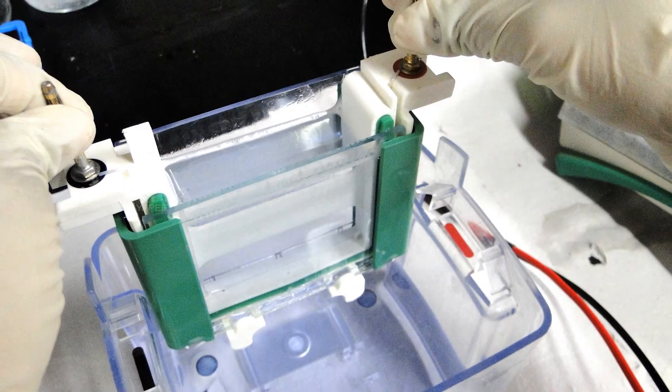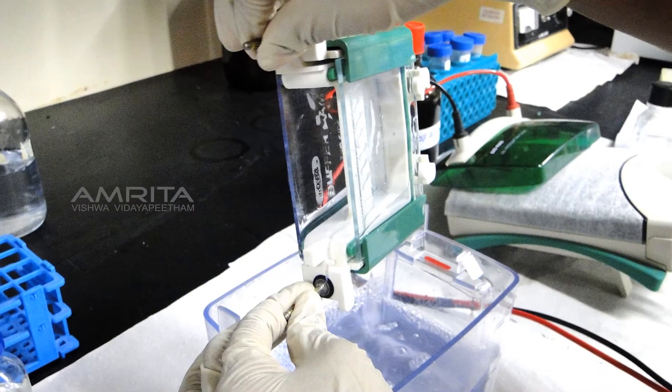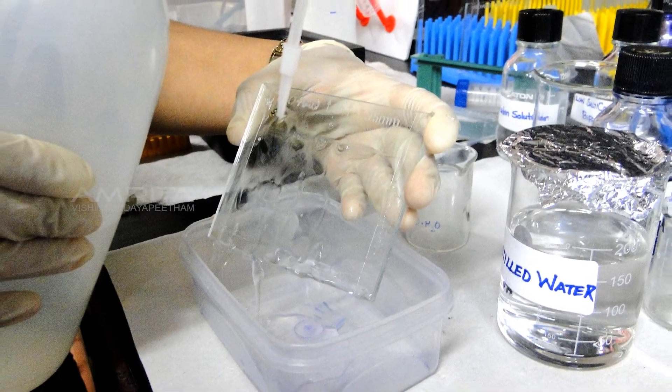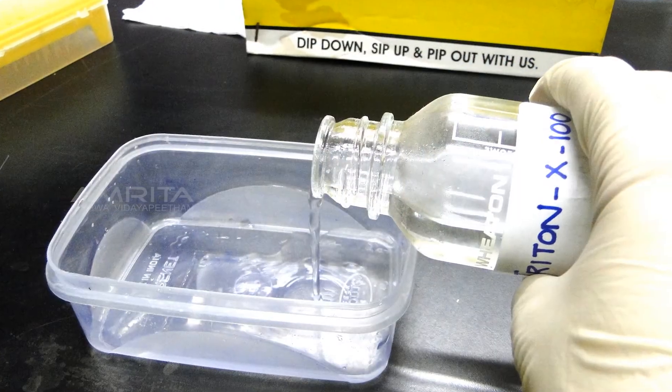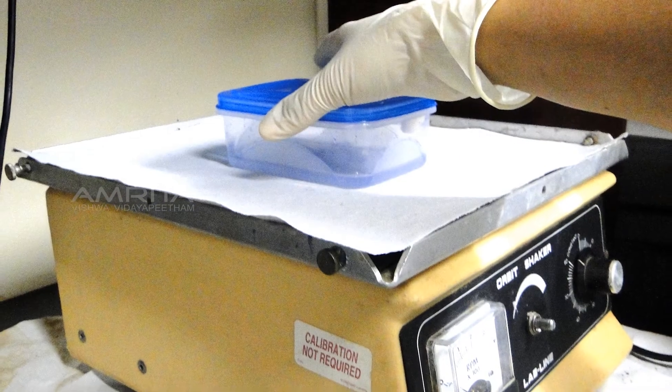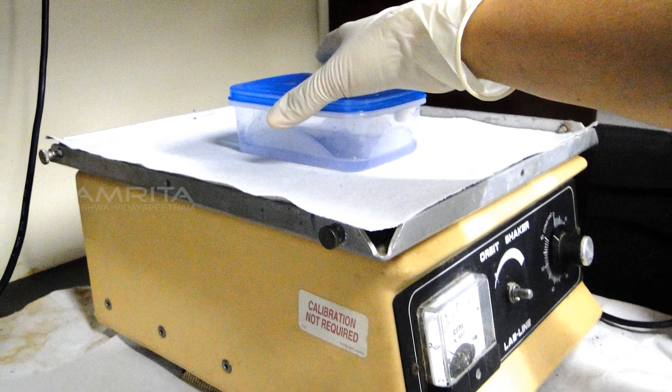Take out the gel plates and remove the gel from the plates into a box. Wash the gel with distilled water. Pour Triton X-100 into the box containing gel and keep it for 5 minutes in the orbit shaker. Repeat this step thrice.